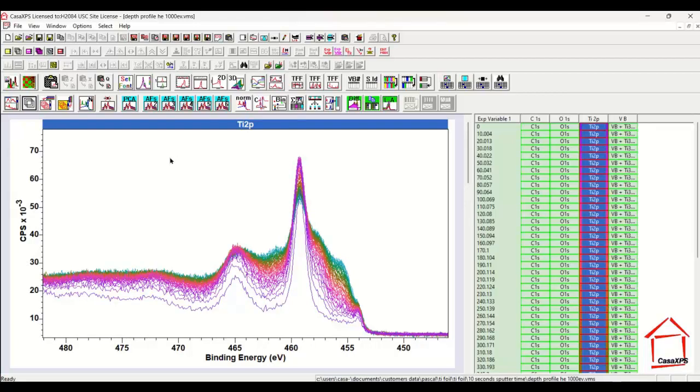And the basic tool for understanding what's happening in XPS is to try and quantify data. So we try to calculate the atomic concentration, that's what we would like to think, but what we are actually doing is we are normalizing the signal with respect to the total signal that we're measuring, and therefore taking out certain artifacts that might be introduced by variation in X-ray intensity, for example. So instrumental factors, maybe sample factors that alter the relative intensity. And so for this depth profile, I'm calling it depth profile, but it's still supposed to be at the surface, this profile we can understand the changes by calculating the atomic concentration and presenting it as a plot as a function of the sputter time. And that's what I'm going to do now.